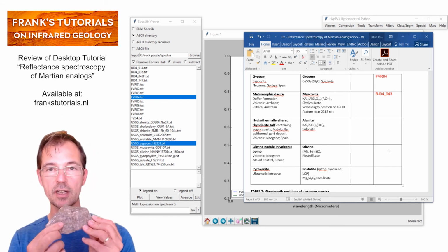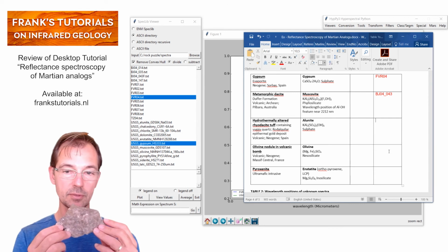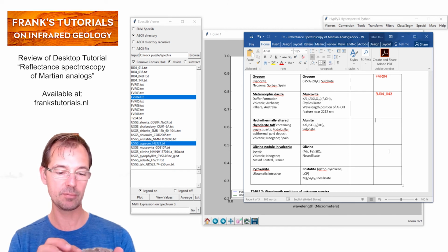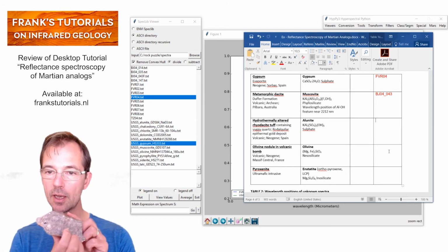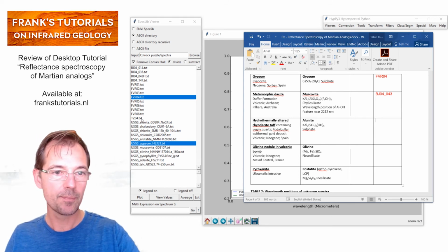It contains vugs because of dissolved rock fragments and crystals, and it also contains some brighter and flashy alteration minerals, which could be an indication of alunite. So let's have a look.